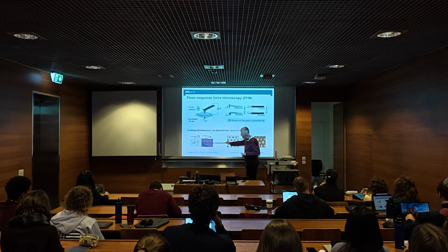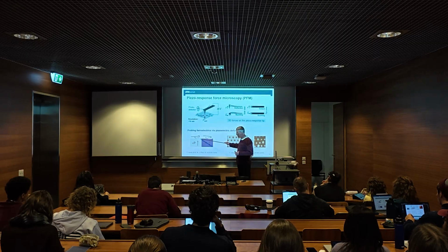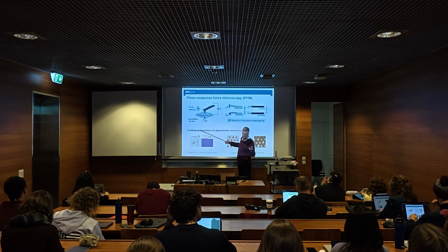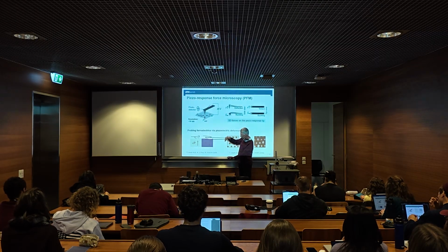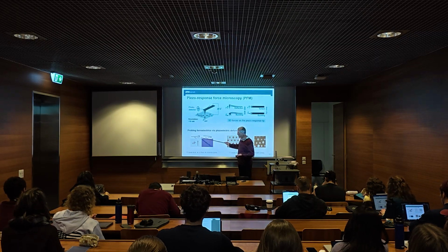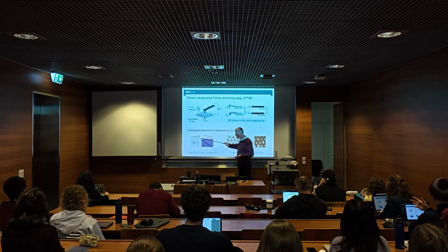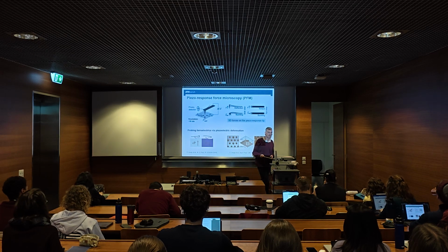If it's a piezoelectric material, the voltage deforms your material locally. So either that's the piezoelectric effect, you make your material longer or shorter. By the voltage, you buckle your material or you create a dent, and that is then what you measure in the atomic force microscopy mode.